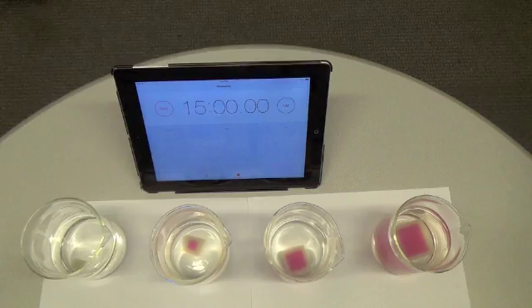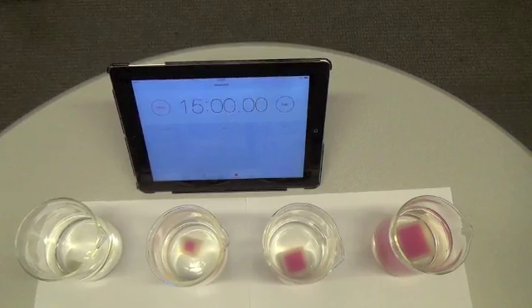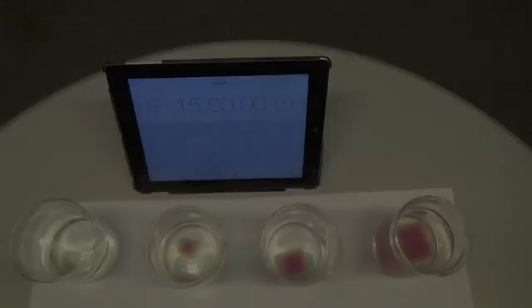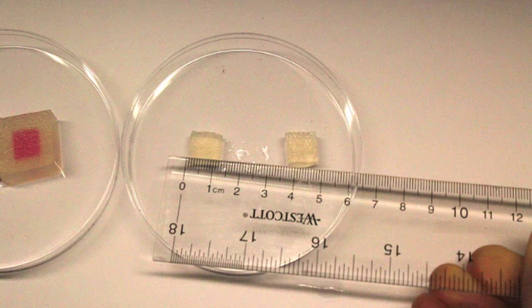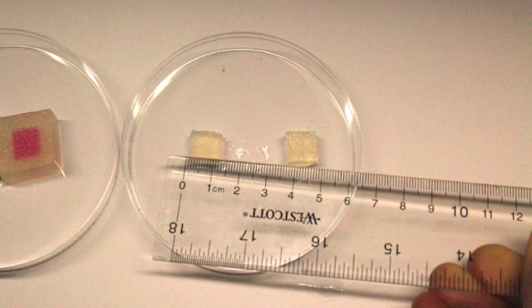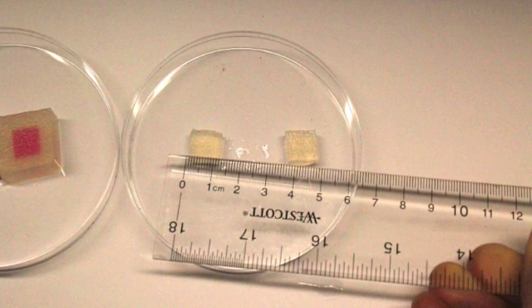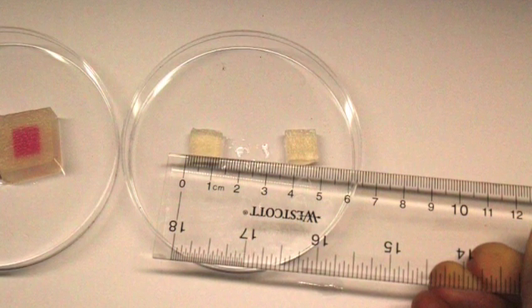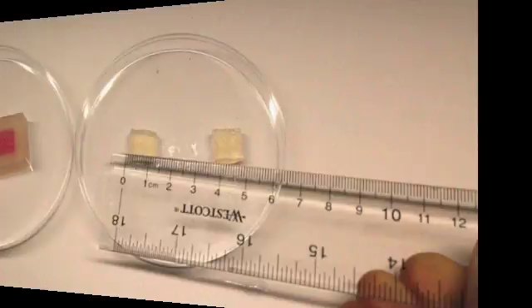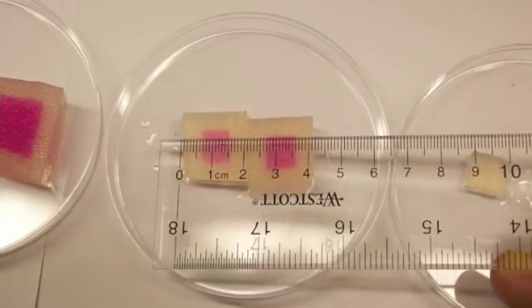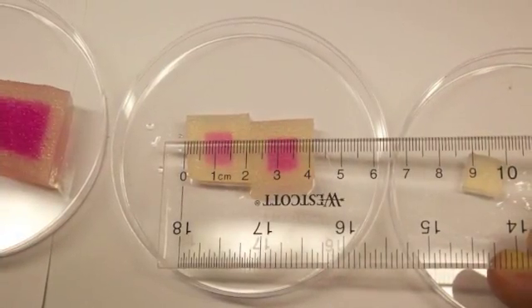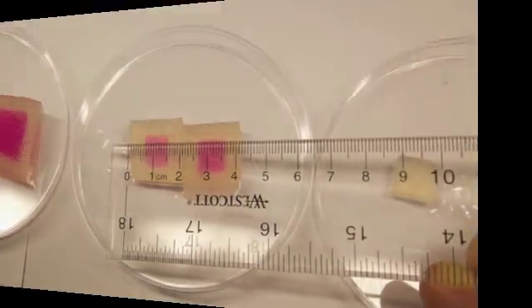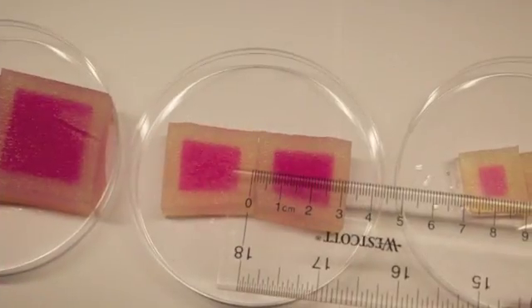After 15 minutes, we cut the cubes in half. Notice how the color change in the small cube is complete. There is no magenta remaining. This is because the acid in the beaker was able to diffuse all the way into the smallest cube by moving from high concentration to low concentration.